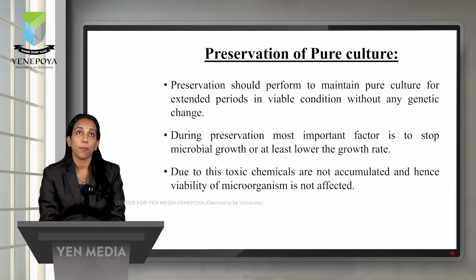Then coming to the next topic, this isolated pure culture that we have prepared, we need to preserve. How can we preserve this isolated pure culture? Why do we perform preservation? In order to maintain the pure culture for an extended period in a viable condition only. There should not be any genetic changes. For that we preserve the isolated colonies or isolated culture.